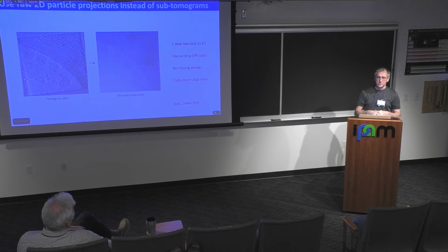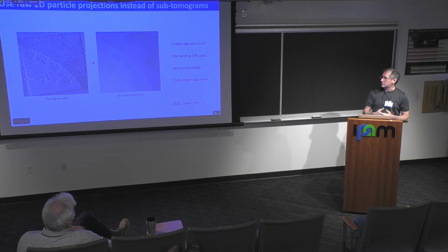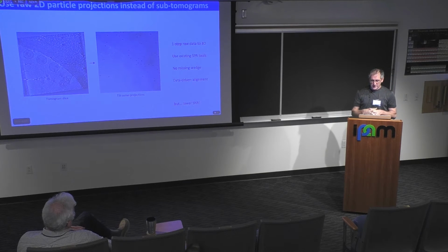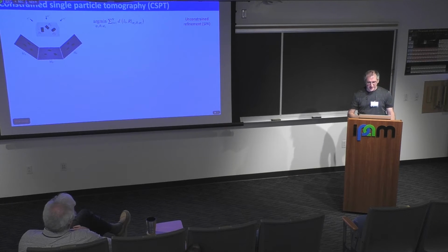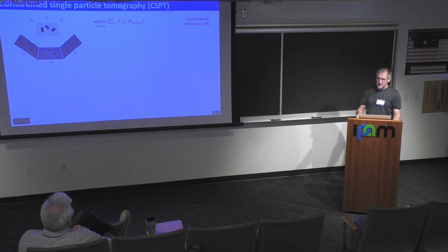And that means that you can actually do data-driven alignment, which is going to help you get to higher resolution. There is a caveat, right? The caveat here is that each of those images is going to be very low resolution, much lower than single particle, because now we're fractionating the dose into 40 projections, right? So each of those 2D projections is going to have a much lower signal-to-noise ratio than what you're used to in single particle cryo. And that's actually a very important but, and I'm going to tell you now ways in which you can work around that problem.